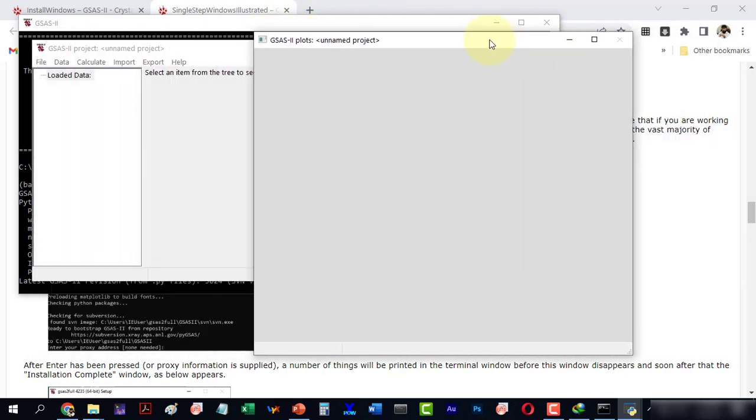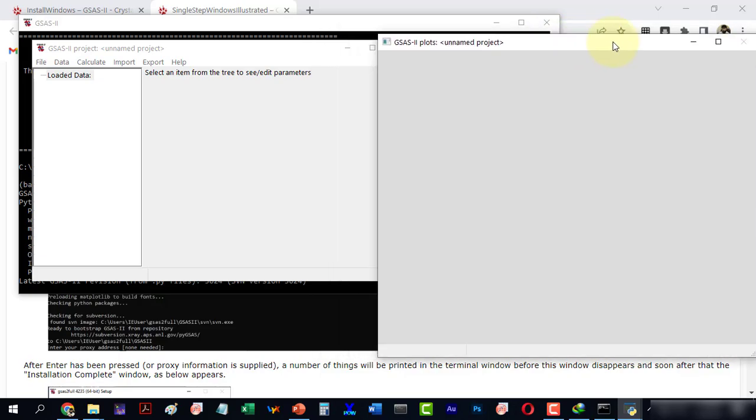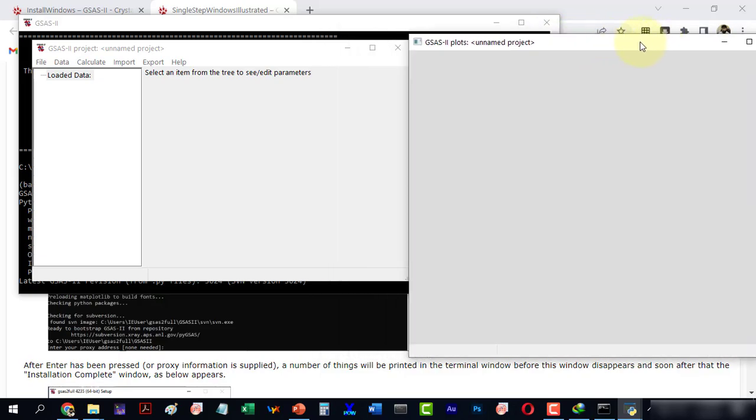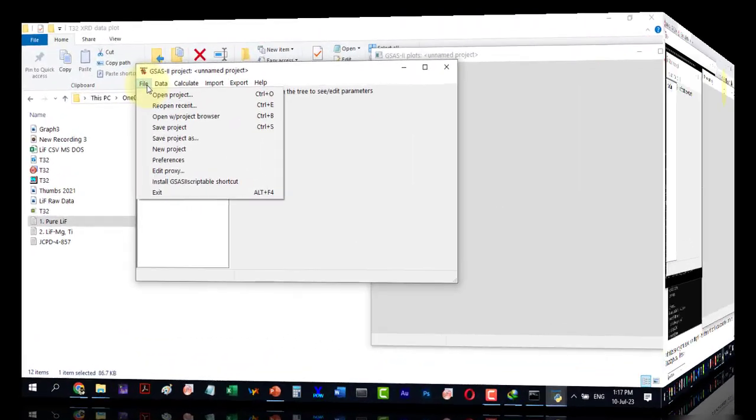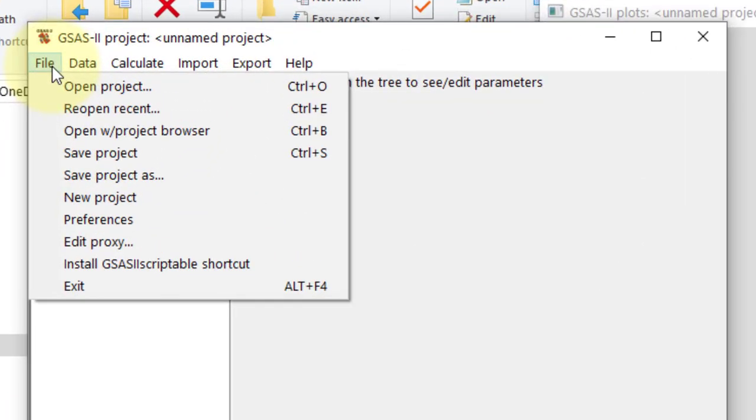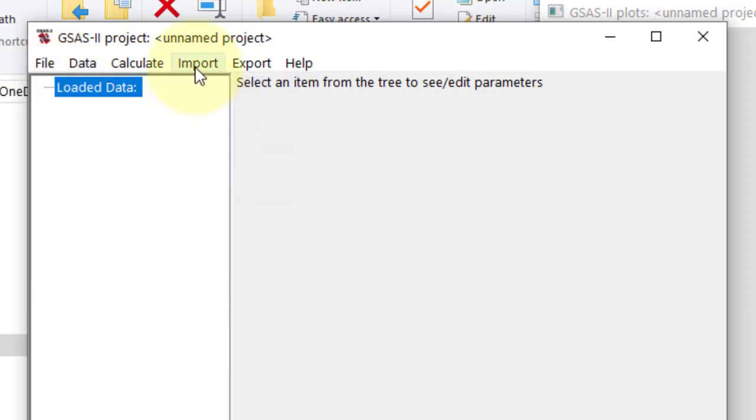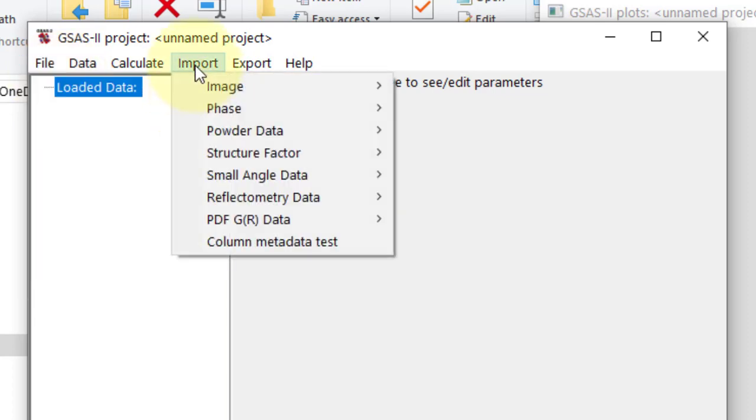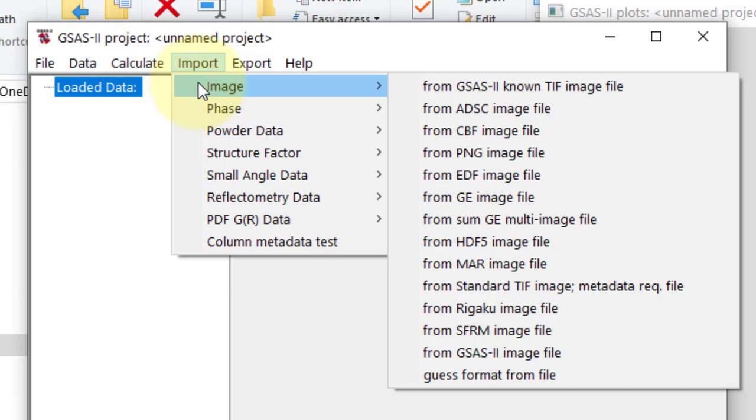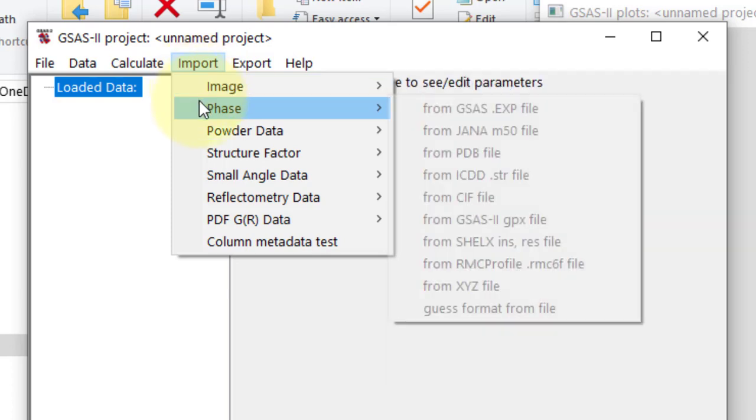This is the graph window which will display the plot. All the menu options are here and we can import our data file, phases, and other parameters one by one.